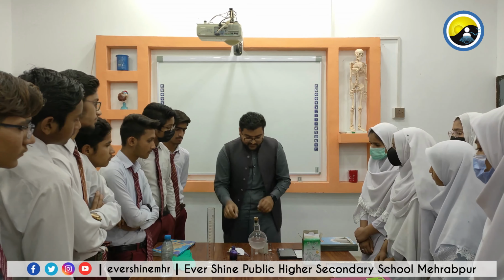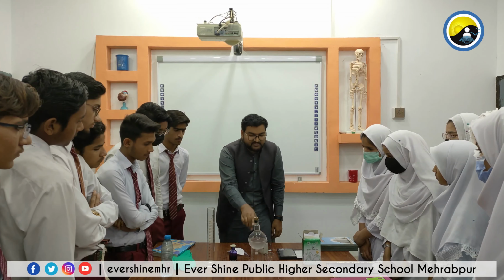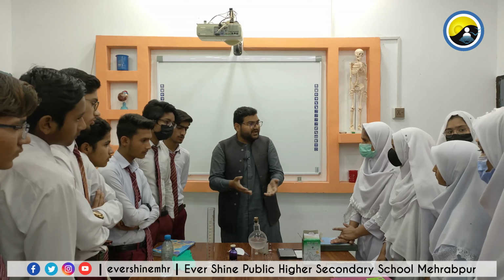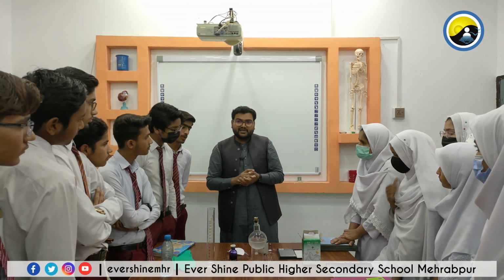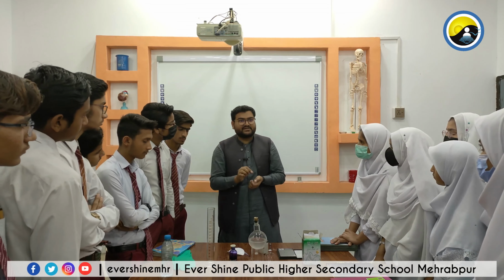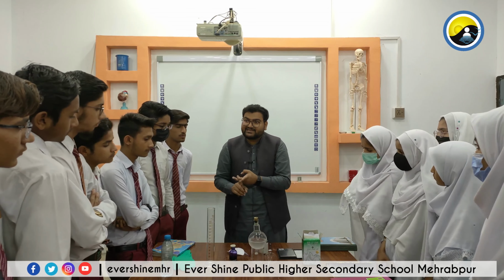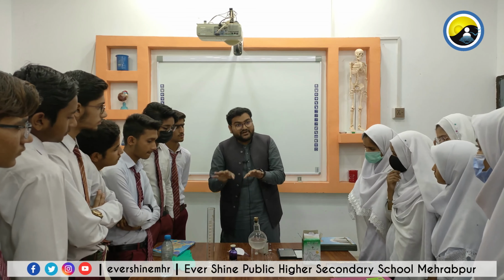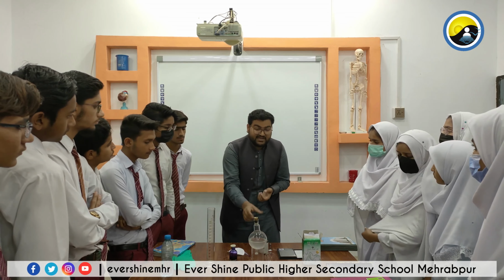We have added the methylene blue to our solution. Can you tell me the color of the solution? It is colorless. So when methylene blue is added to a redox reaction, if the color is colorless, it means reduction is happening. What will happen if I oxidize this solution?